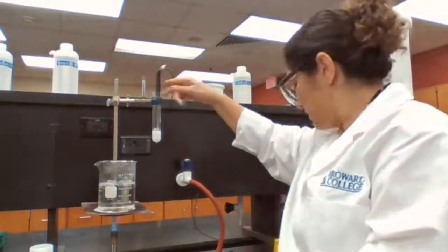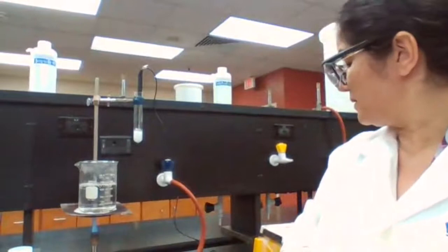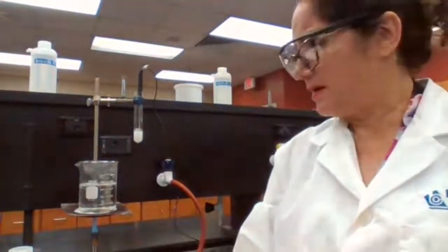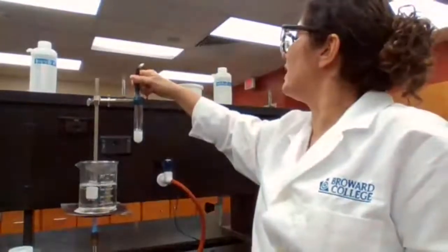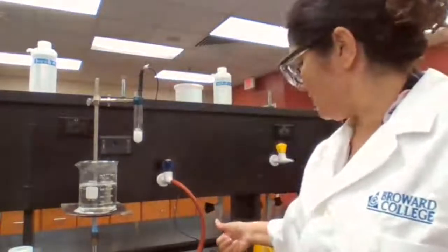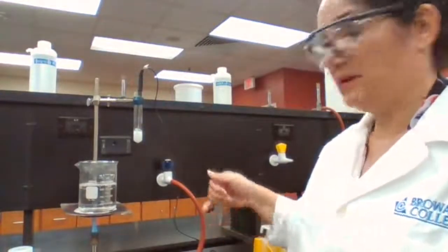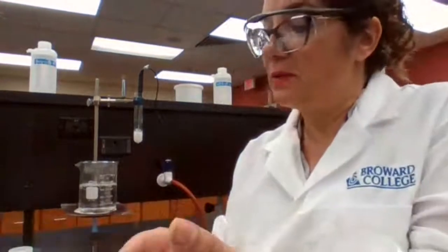Okay. The theoretical value for freezing point is supposed to be 49.9, but the value shown here is slightly higher and the sample is frozen. So I'm going to record what we have here, but it could be the thermometer.